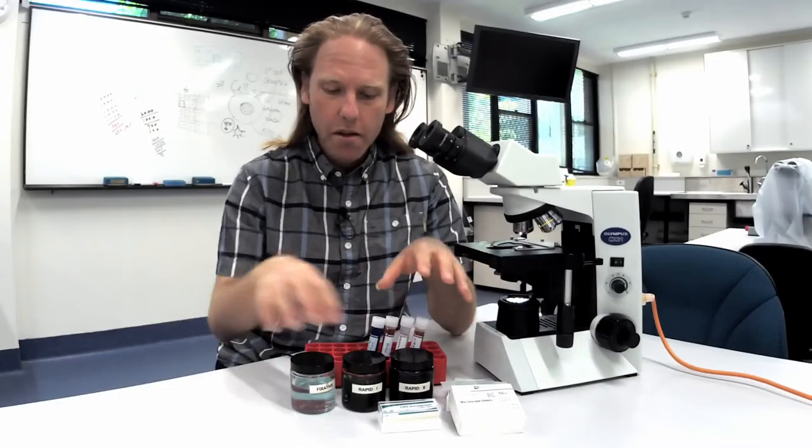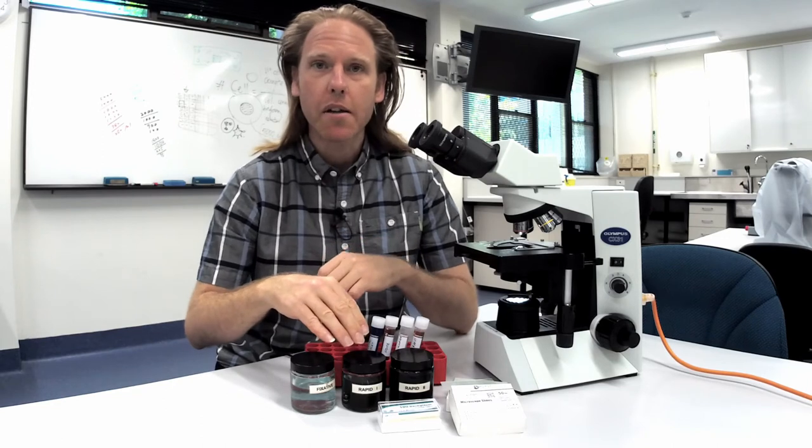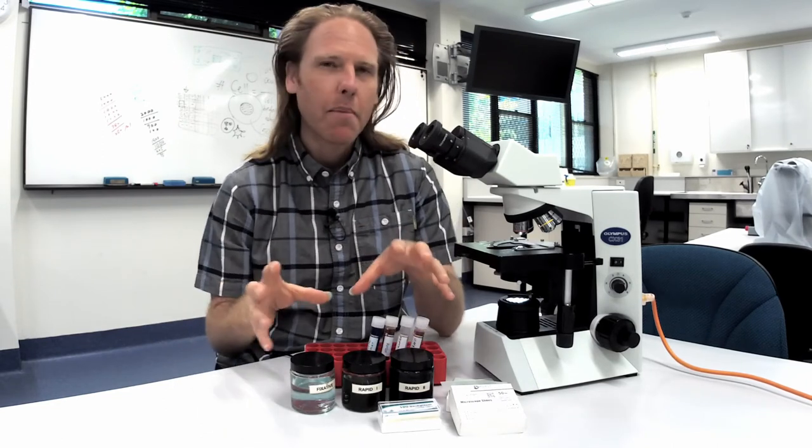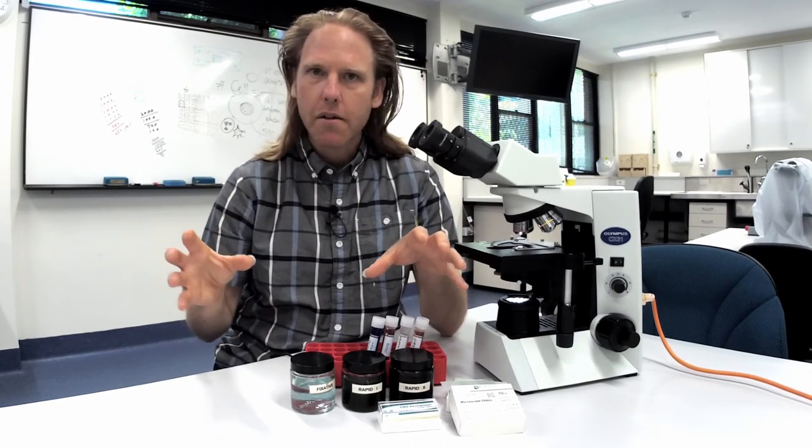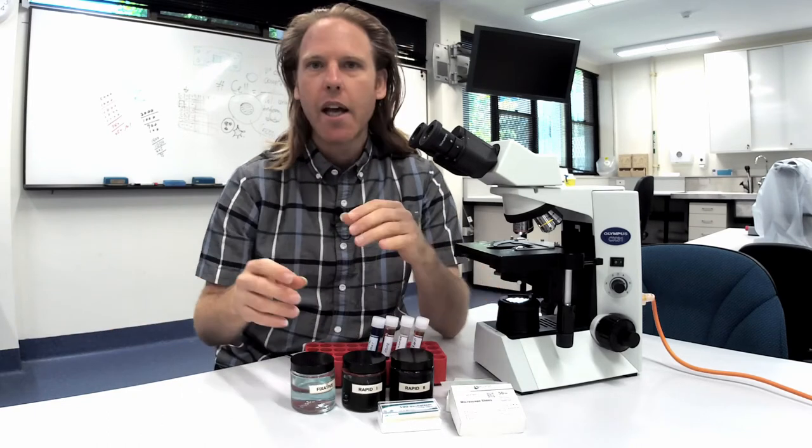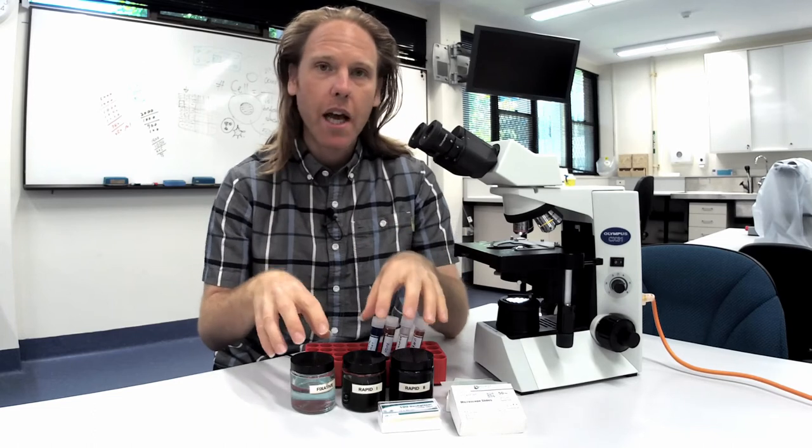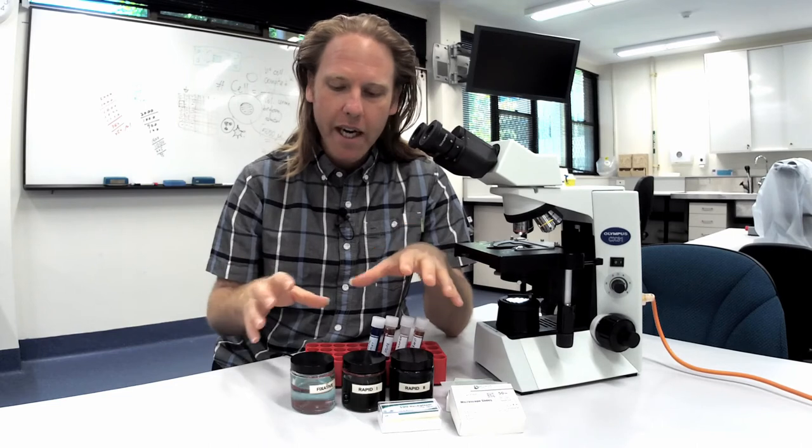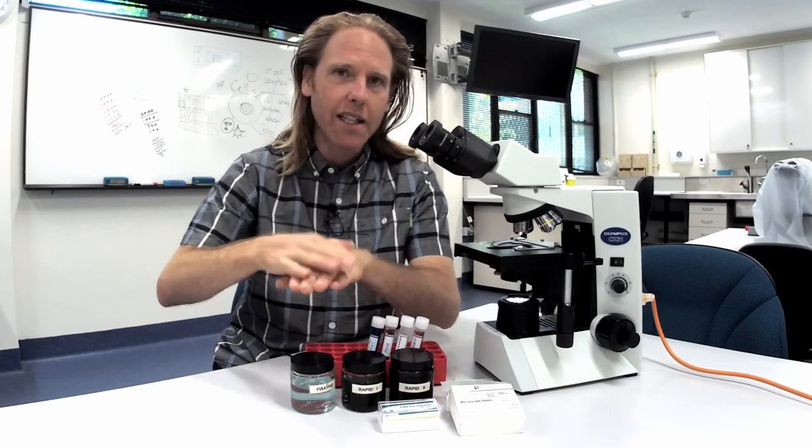Difquik stain consists of three components, a fixative and then solution one which is eosinophilic and solution two which is basophilic. Now a couple of tips to get the best out of your stains it's good to have separate kits for clean work like fine needle aspirates and then again for dirty work like ear swabs and tape preps. Make sure you cover the stain jars as soon as you've finished working with them to stop the material evaporating and you can further minimize this by putting some cling film between the jar and the lid.